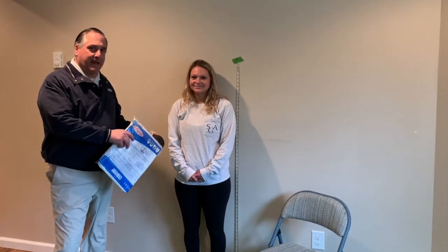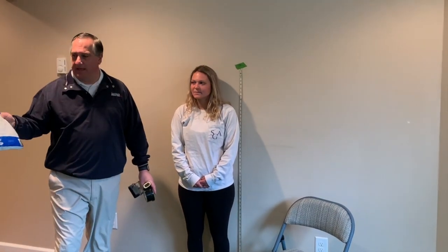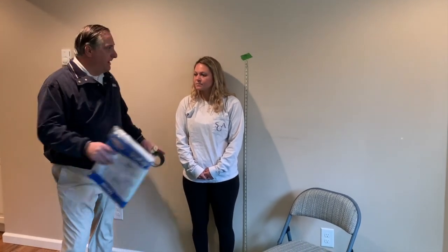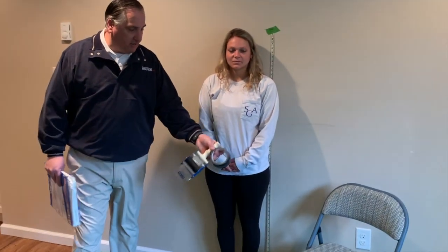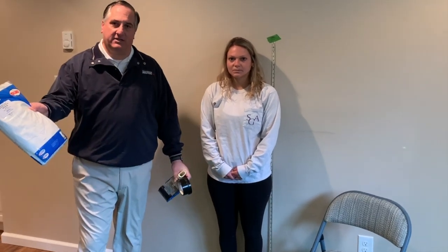Hi, my name's George. I'm here with Maddie. Today we're going to show you how you could fit someone who is approximately 154 centimeters into an Indutex spray guard coverall size 5X. You can see that Maddie's approximately 154 centimeters and she's less than 45 kilograms. So all you need is a chair, some packaging tape or duct tape, and a 5X coverall, and I'll show you how you can fit Maddie into that.